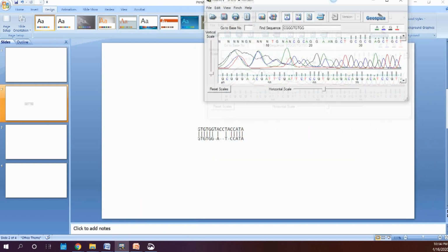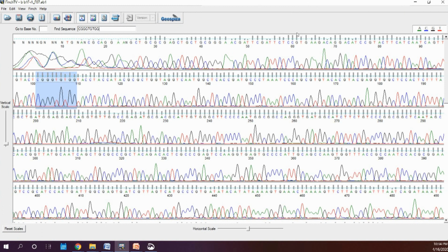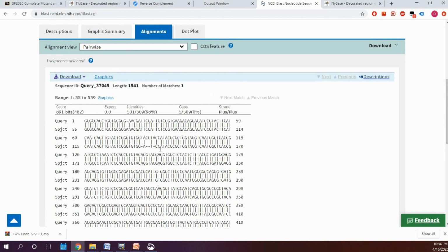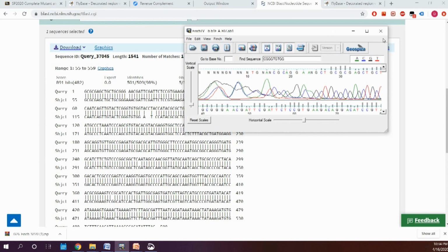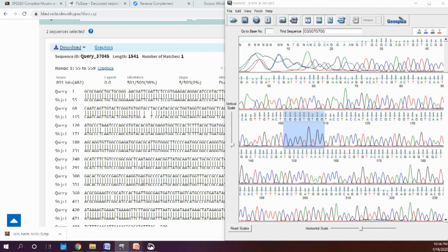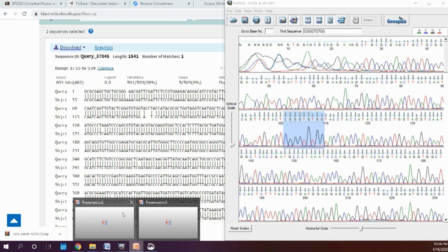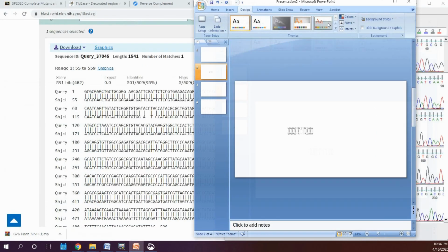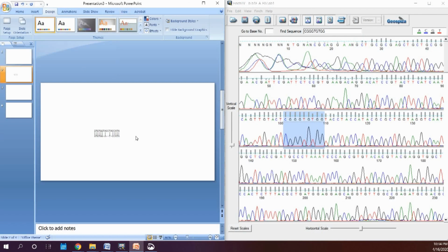next thing you want to do is you want to find that sequence in here. So actually, let's go back to NCBI. Okay, so the highlighting is gone, but what we can do is do this. So put that there. Nope, let's close this. Yep, there it is. Snap it. Okay, so we can just find that sequence. GTGTGGTACC there. So that's the sequence right here.